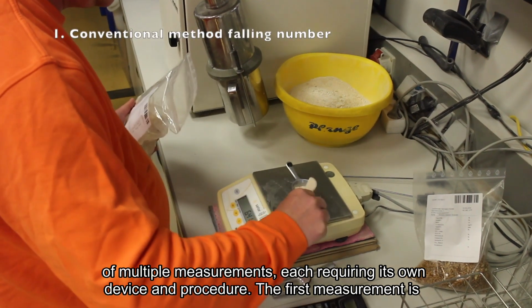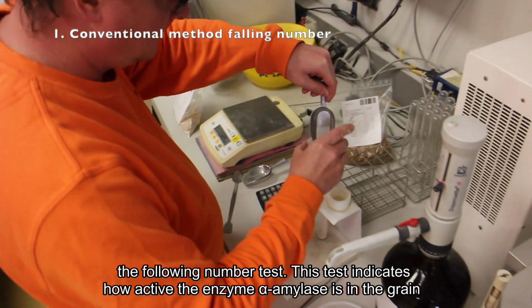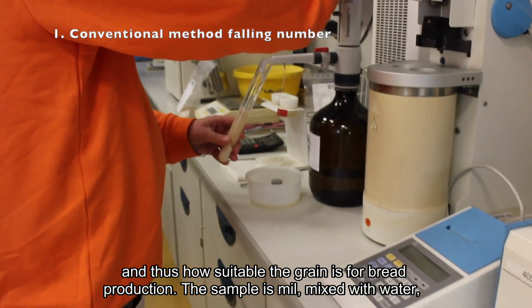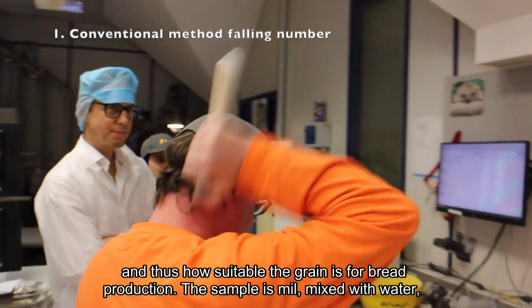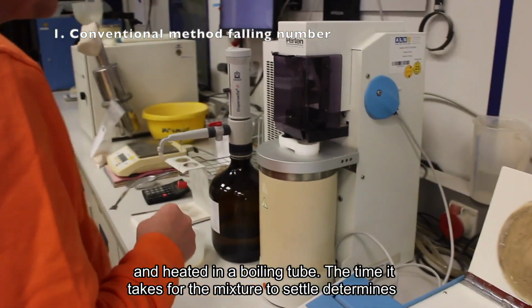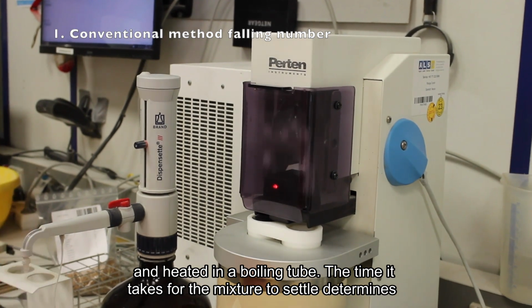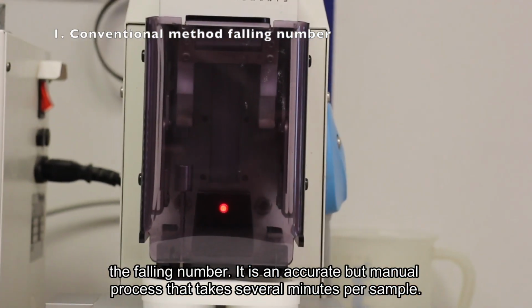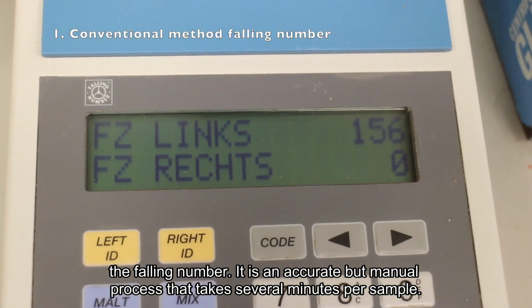The first measurement is the falling number test. This test indicates how active the enzyme amylase is in the grain, and thus how suitable the grain is for bread production. The sample is milled, mixed with water, and heated in a boiling tube. The time it takes for the mixture to settle determines the falling number. It is an accurate but manual process that takes several minutes per sample.